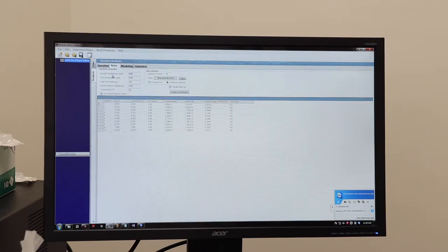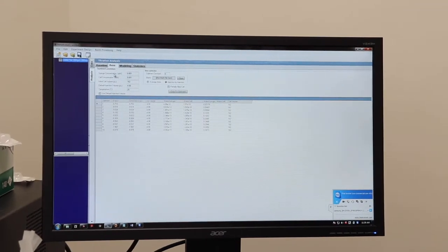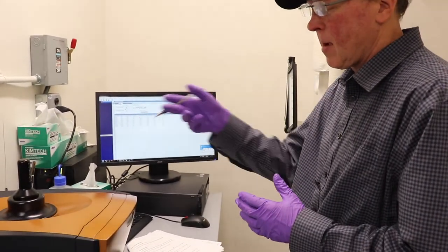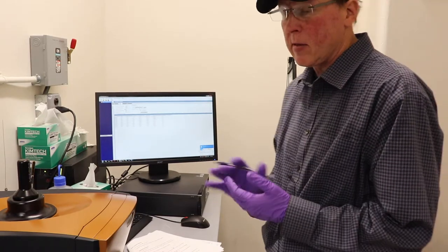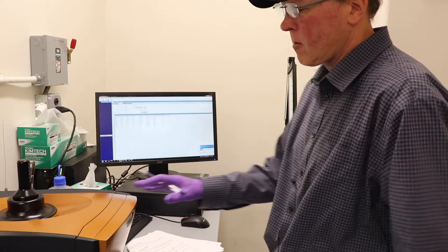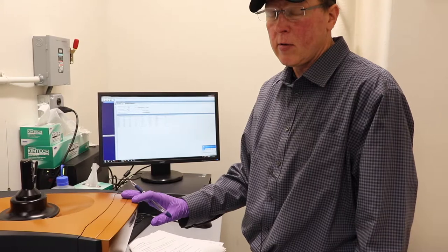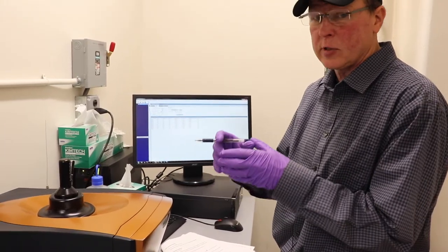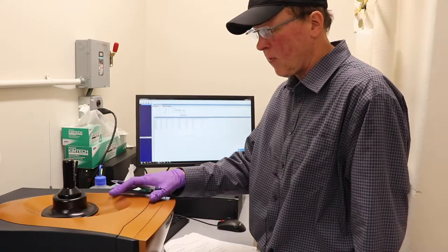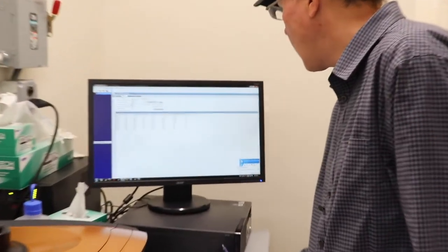So next we'll go to the area tab. And here what you want to do is confirm that the concentrations, the injection volume, and the cell volume are all correct. So for water, we just leave the cell concentration at 0.001. It's kind of arbitrary at that point. Now this initial cell volume for this particular ITC was calibrated at 182 microliters. Now a big question comes up. Well, I added 350 microliters of sample. Why do I put 182 microliters as my cell volume? How does that incorporate the proper mathematics in the formulas to figure out my KD? That's because the nano ITC is designed to work in overfill mode.